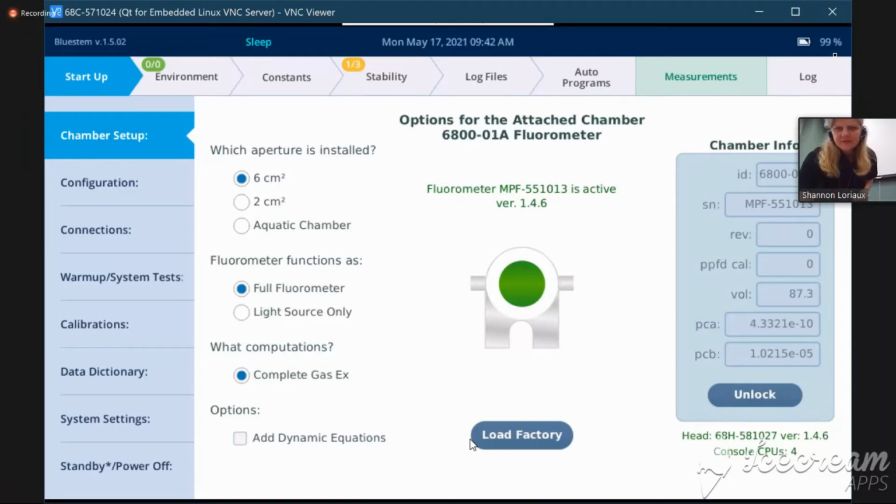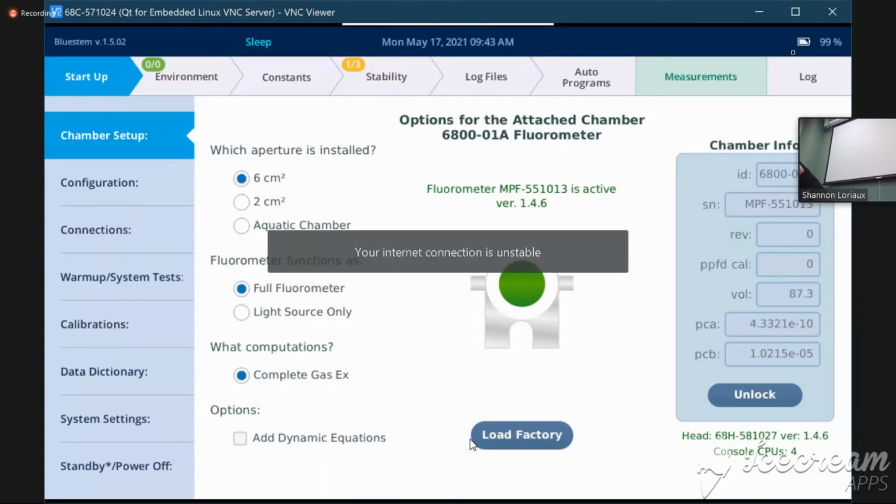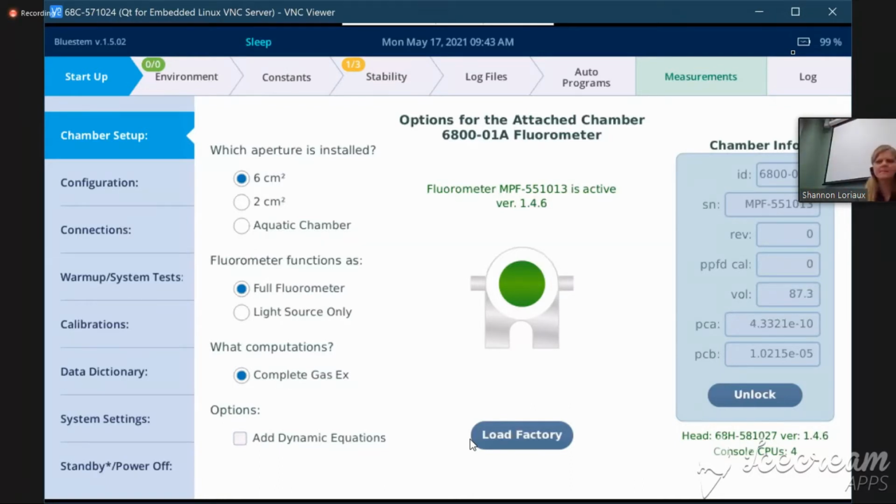This is one of the things that you can edit of the instrument and set it to your personal preference. Right now, my instrument is set to indicate percentage of battery life. If you'd rather, you can actually switch that and have it show you the time your battery has left, which may be more useful in practical purposes. And I'll show you how to switch that in just a moment. I'm going to go ahead and plug my instrument back in so it fully charges my batteries for me. You see that indicator change back to the battery indicator.